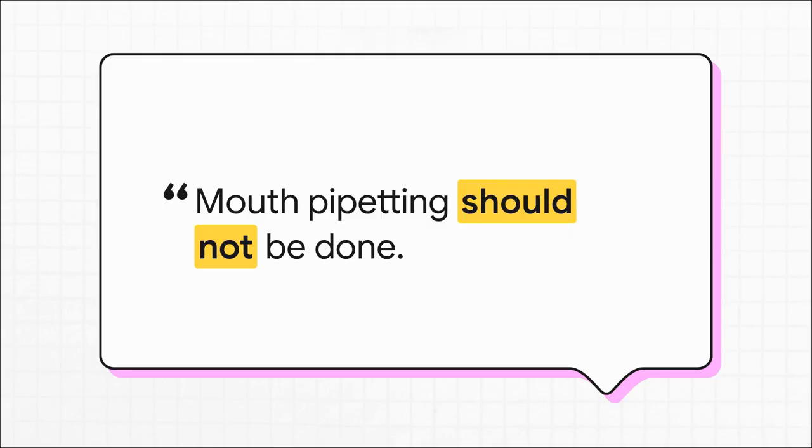I want to pause on this one for a second, because it is an absolute. Never, ever, ever use your mouth to pipette anything. I don't care if it's a toxic substance, a biological fluid, or even just water. The risk of accidentally ingesting something hazardous is just way too high. We have tools like automatic pipettes and pipette pumps for a reason, so use them.